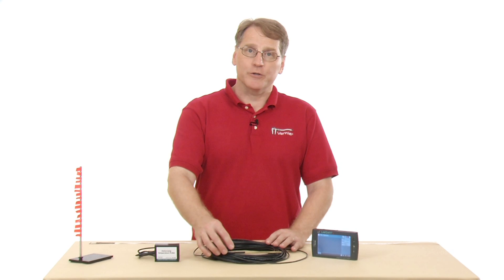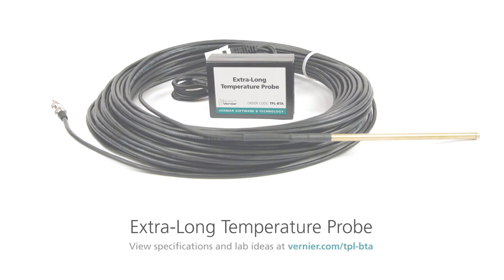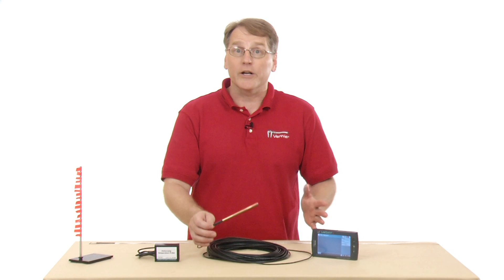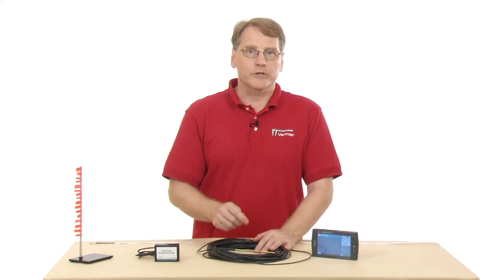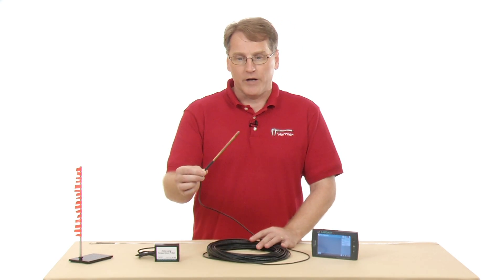This is the Vernier Extra Long Temperature Probe, and the key feature is that it has a 30-meter long cord, which allows you to measure temperatures far away from your collection device. Perhaps you're using a computer indoors and you want to measure the temperature on the roof of the school — you could run the cord up there if you wanted to.